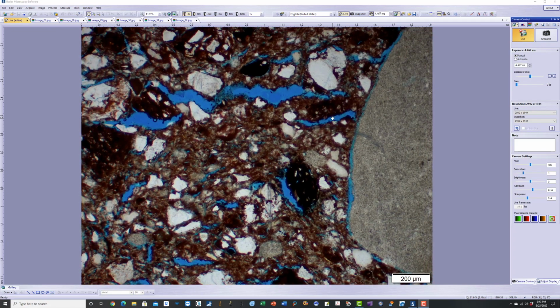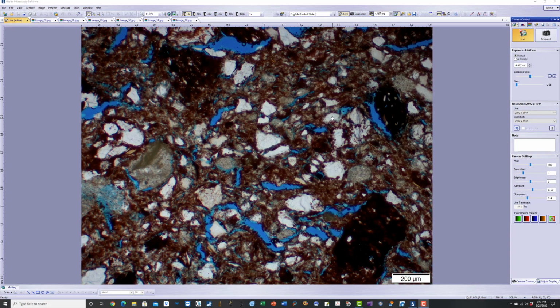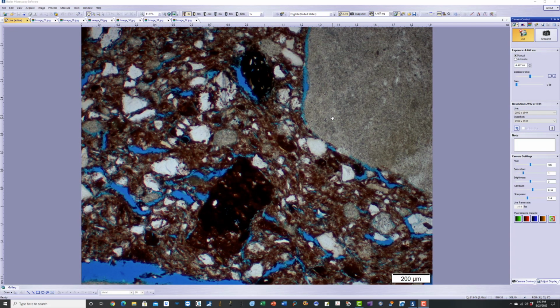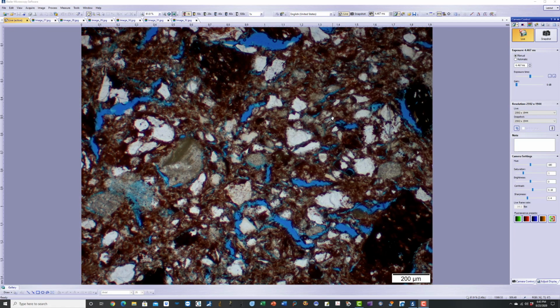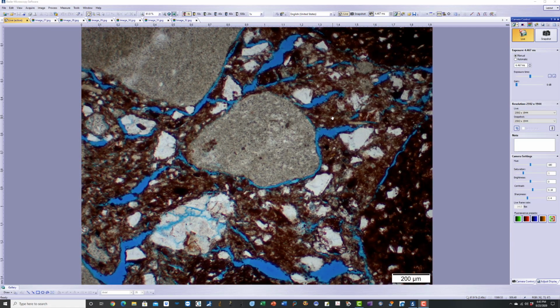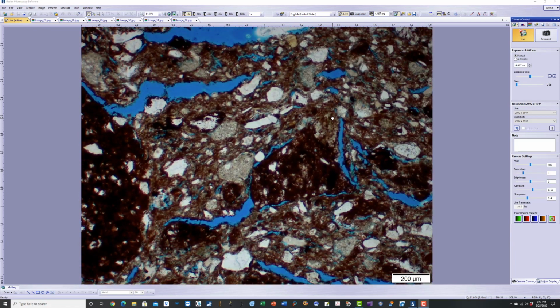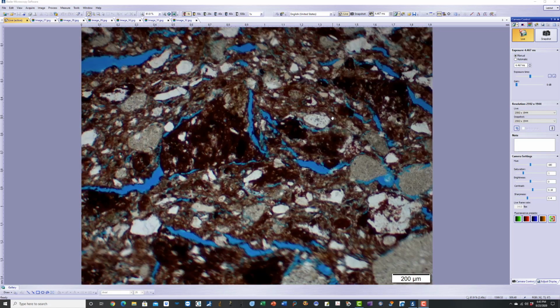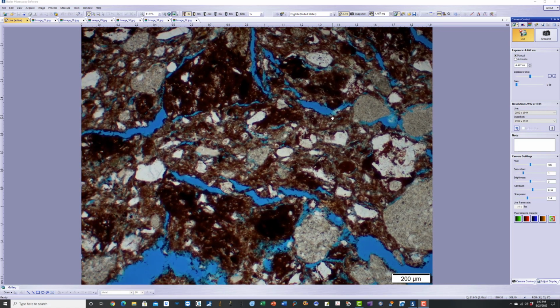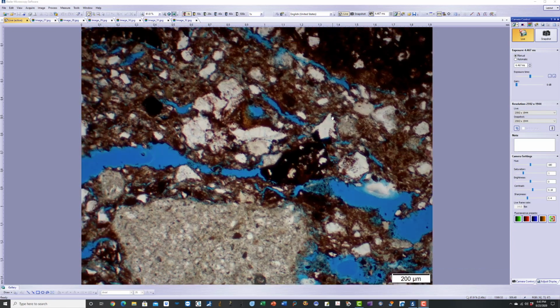In the tempered additives, you have rock fragments and mineral fragments, mostly quartz sand. Here you can see a lot of quartz sand, as well as previously fired bricks, which are called grog particles, G-R-O-G, grog particles, previously fired brick fragments, and organic matter, which you see many times.